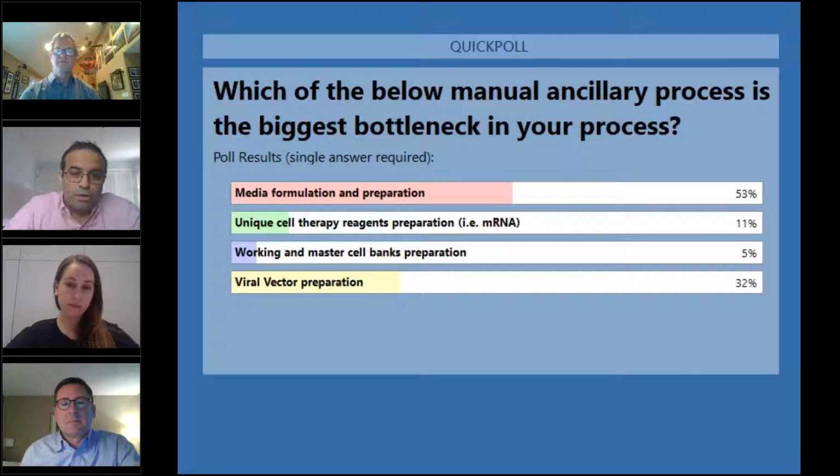Think smaller bags, smaller tubing IDs, etc., that work for us in the autologous cell and gene therapy space, when you're talking about mLs as opposed to the biopharm space. And also the accuracy that you need at that small a scale.